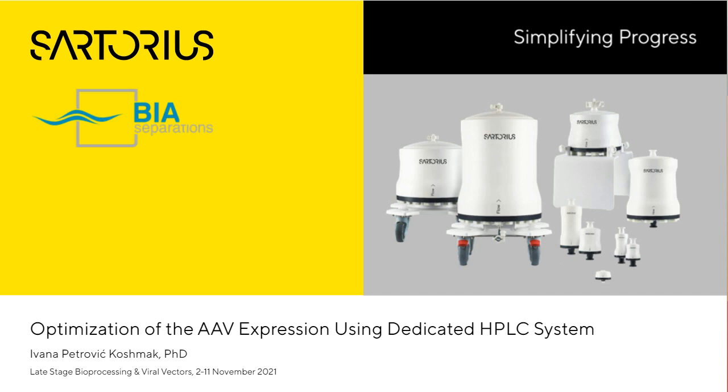As mentioned, my name is Ivana, and today I will present to you our approach in optimization of AAV bioprocess using an HPLC system. So in other words, I will show you all the different ways in which you can use an HPLC system to analyze complex samples.